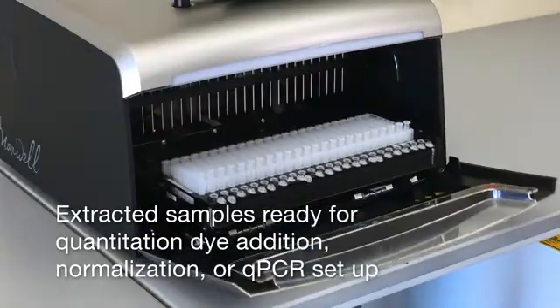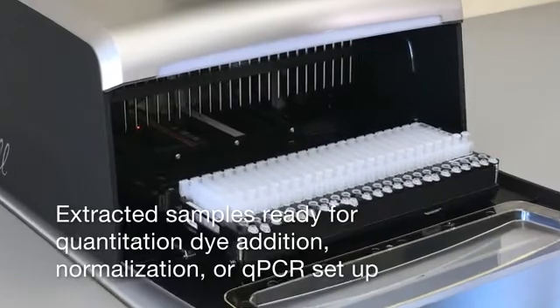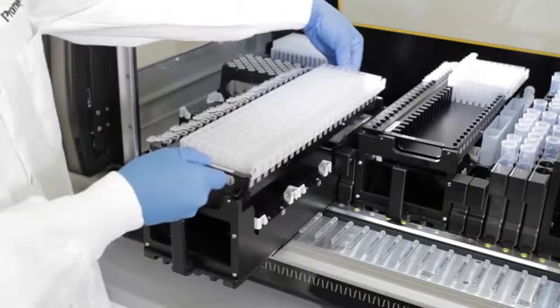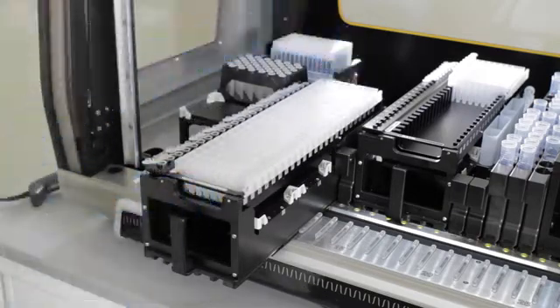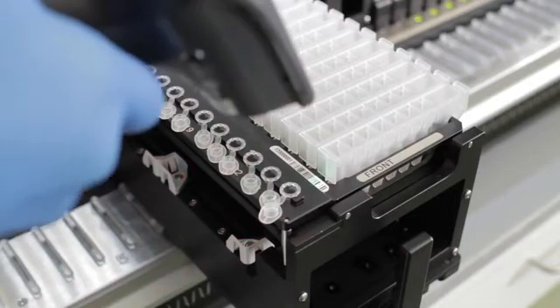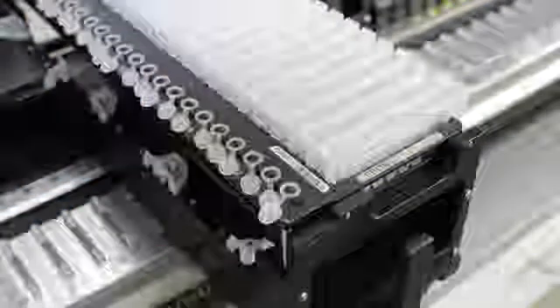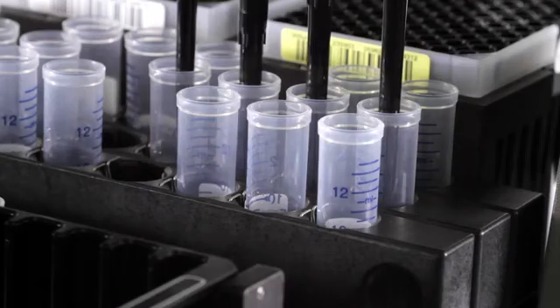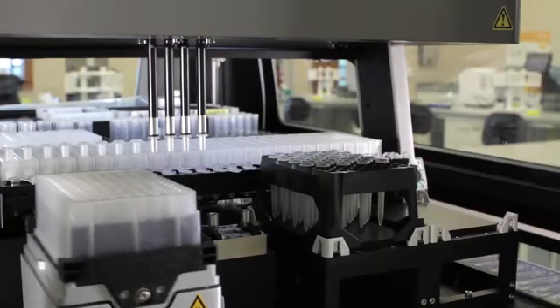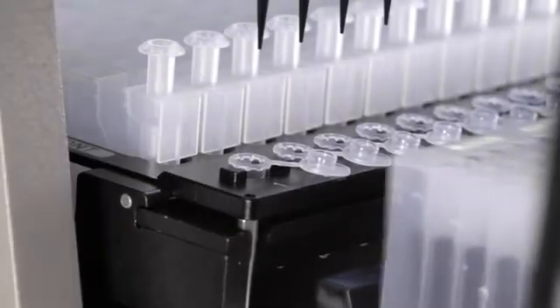This modular workflow allows you to create an assembly line approach to extractions. While the Maxwell instrument is busy extracting one set of samples, the MaxPrep Liquid Handler can immediately begin preparing the next set for processing. The efficiency and flexibility of the Maxwell cartridge system lets you process samples on demand, eliminating the need to batch samples for full 96-well plate runs and reducing reagent waste.